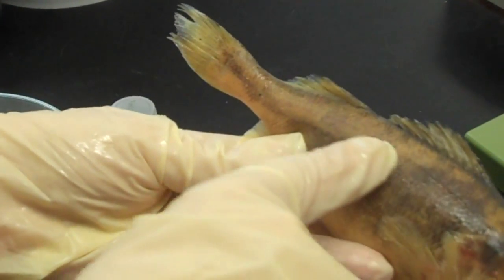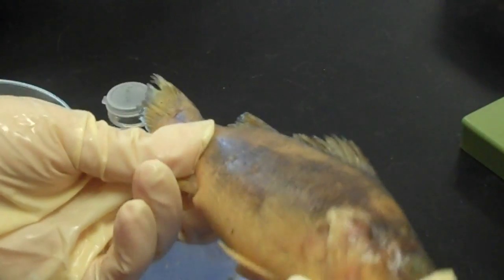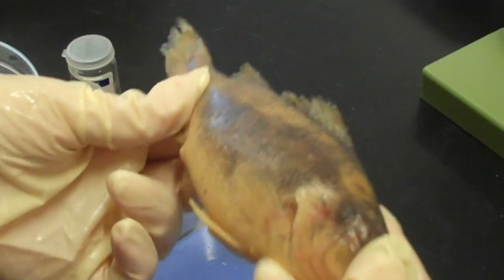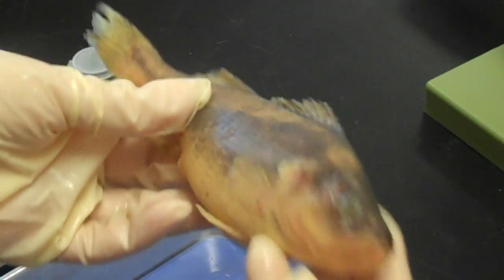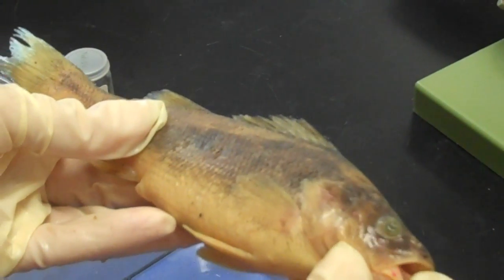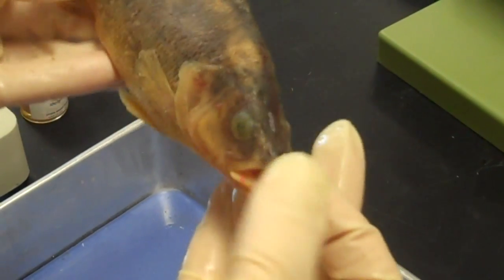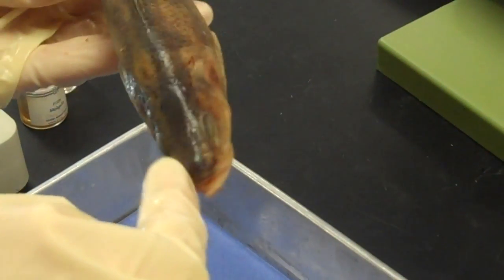You can also see the lateral line system here. It's a sensory system that detects vibrations and hydrostatic pressure changes in the water. This area would be called the cheek. The lower jaw is the mandible. The upper jaw is the maxilla. You can also see the nostrils here — the nares.